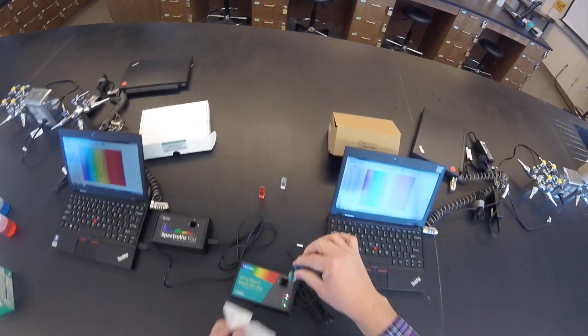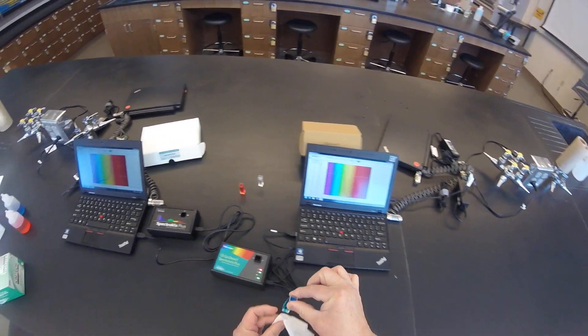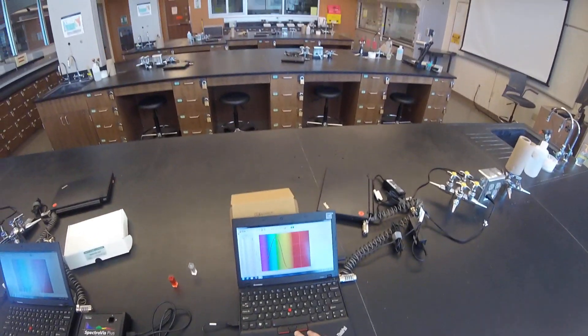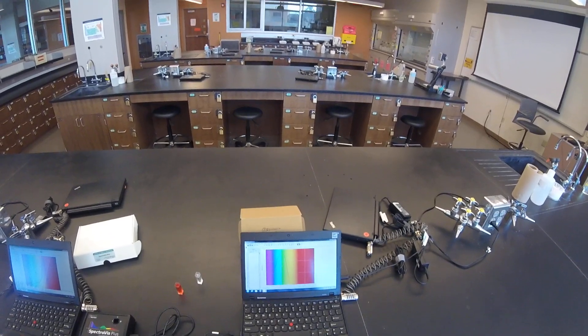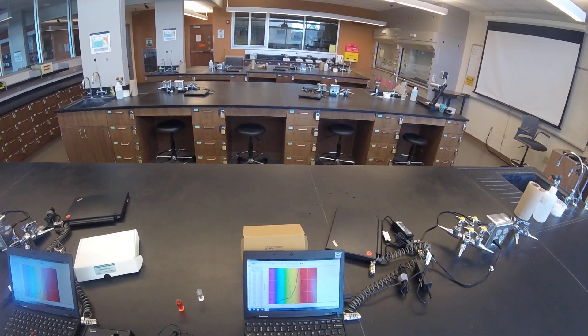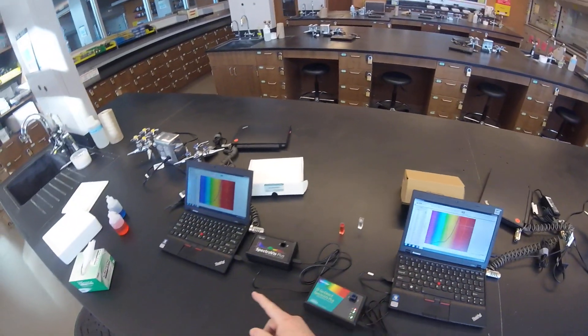I'll take the blue, and we'll go ahead and click Collect, store the latest run so we can compare the two. And you'll see very similar data between the two instruments.